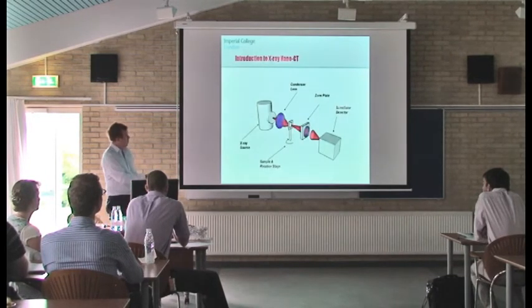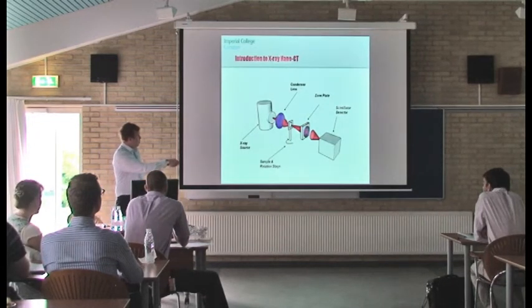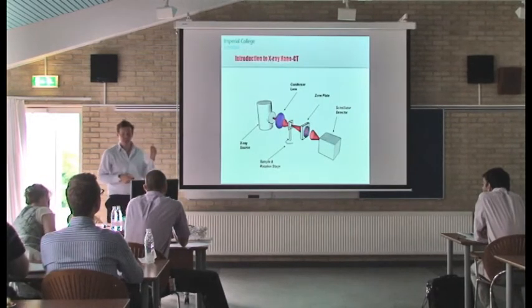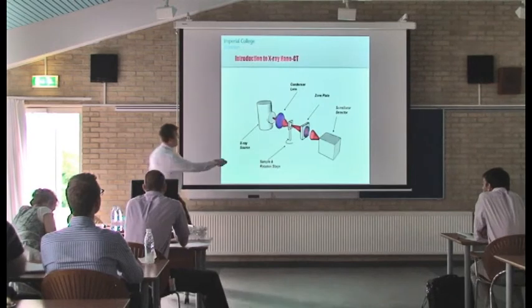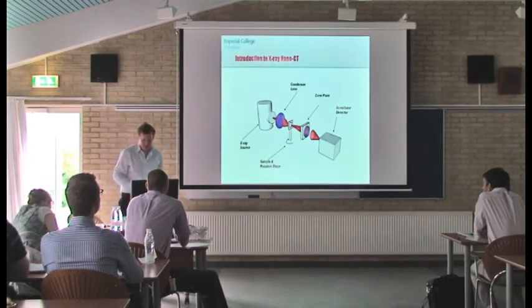So as I mentioned, you can see we have our source, condenser lens, which makes a nice parallel beam before transmission. So now, because we're focusing the lens, we have a field of view within the CT scanner, which is basically defined by this little cube here, and then focused again before we get to our scintillator detector.